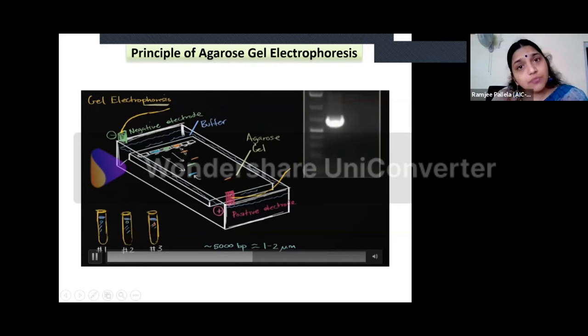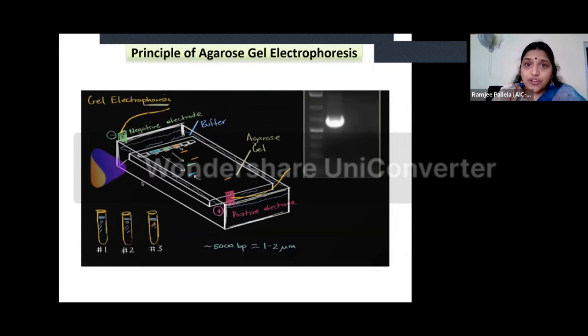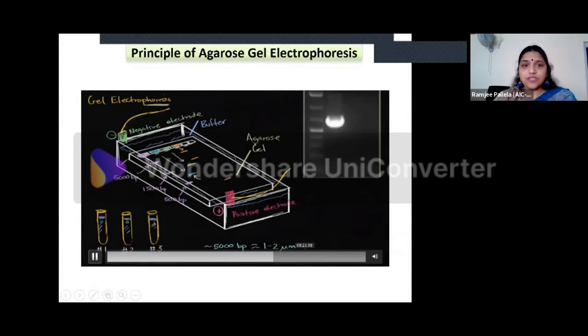In case of certain mutations, it keeps on running down, because there may be two fragments which may have generated. Okay, in case of restriction digestion, when you're doing restriction digestion, then also you can get multiple bands because your enzyme is cutting it at different places. Okay, so this forms the basis of it.